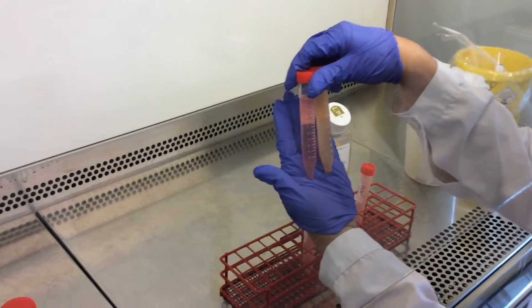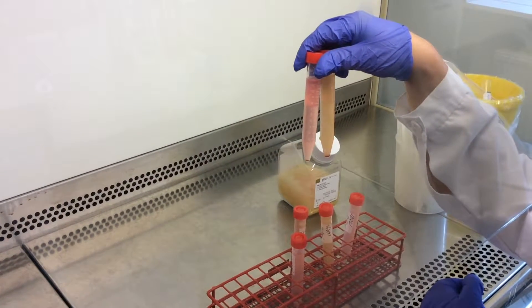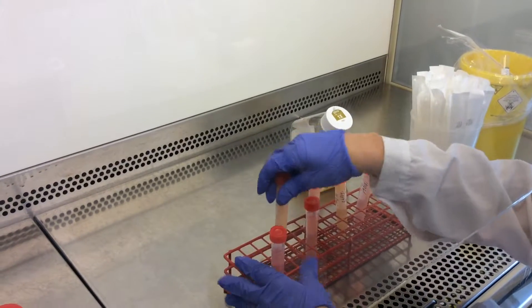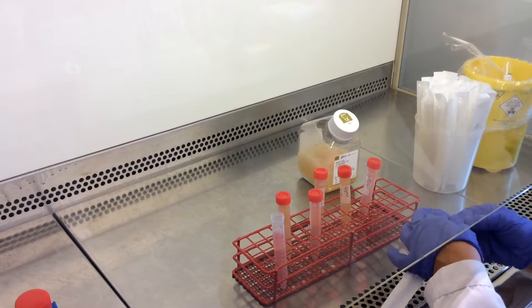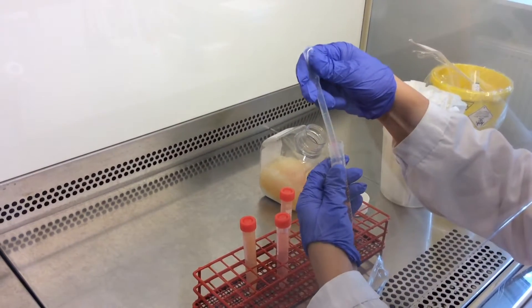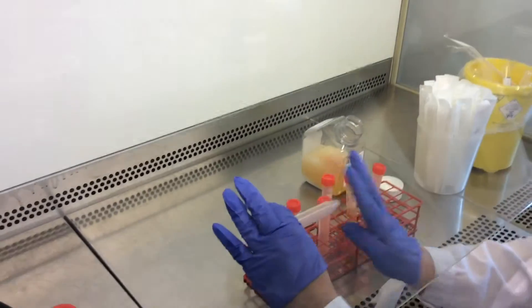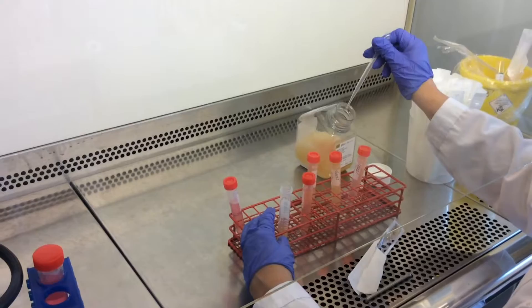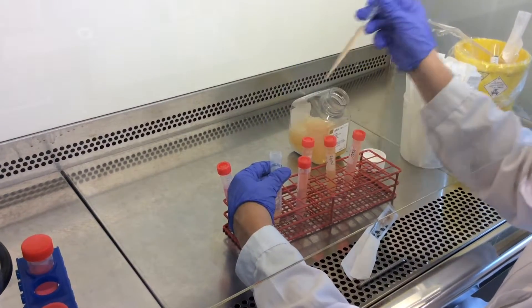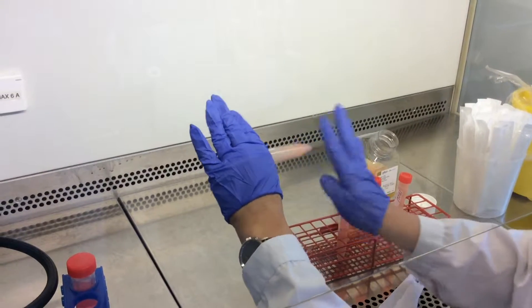Magdalena is showing two different tubes: the one to the left contains a small pellet because it had less blood volume, while the one to the right contains a bigger pellet due to higher blood volume. She removes the cap and uses a sterile pipette to discard the supernatants, then mixes the white blood cells with a small volume of RPMI media.